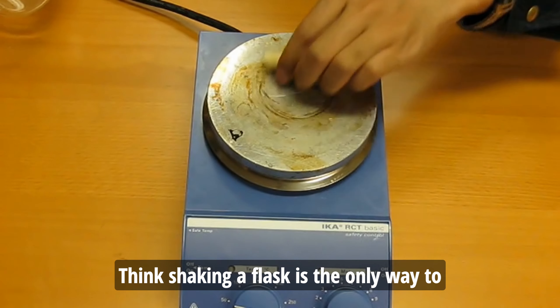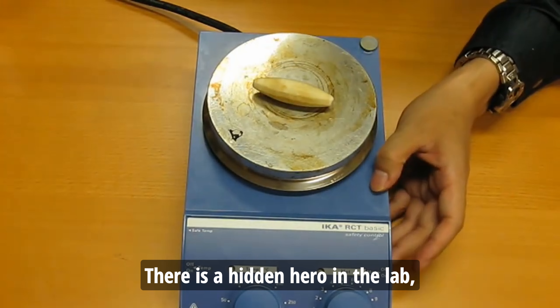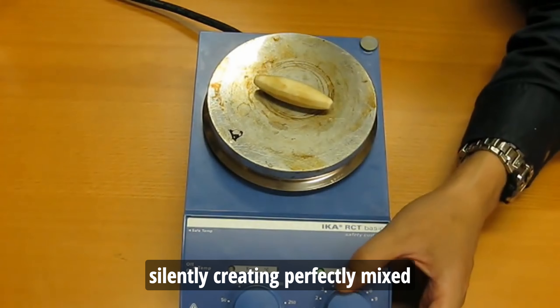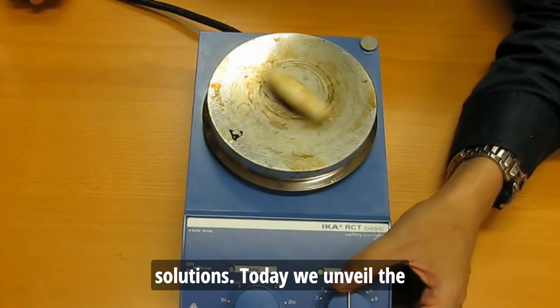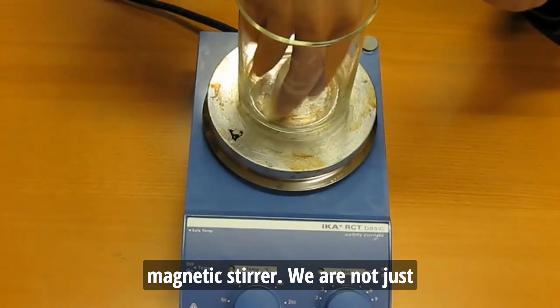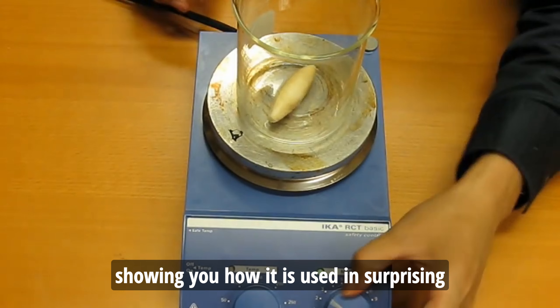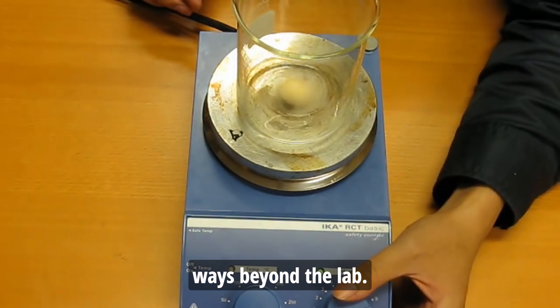Think shaking a flask is the only way to mix liquids in science? Think again! There's a hidden hero in the lab, silently creating perfectly mixed solutions. Today, we unveil the magnetic stirrer. We're not just explaining this science gadget — we're showing you how it's used in surprising ways beyond the lab.